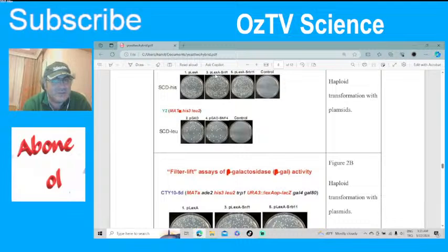You need the binder protein and the activator protein, and if SNF1 and SNF4 work together, bind together and make a complex, then the activator and binder should turn the gene on and give us a color. And this is again a control, and this is the positive control, which should turn the gene on its own. So it's a working combination.